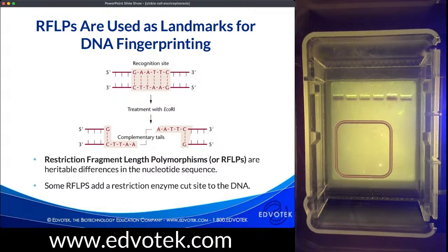So a SNP, or a single nucleotide polymorphism, is a place within the genome where the DNA base pairs at a specific location show variability. So if we're talking about sickle cell disease, this is where one individual has an A and one individual has a T, and the A allele is our wild type allele and the T allele is our recessive disease allele. Now, some of these DNA sequence differences are considered to be restriction fragment length polymorphisms, or RFLPs.